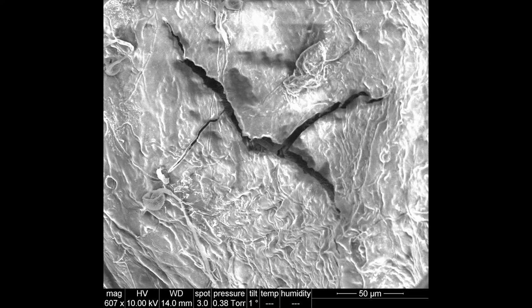If you look at the lower left hand of your screen, you can see the magnification, and you can also see the length scale down there in the corner. Unfortunately, we can't read any of that. It's just the quality is very blocky right now. Okay. Well, I will just talk through what we're looking at in terms of length scale. Right now, this is a blown up version of the poop. It's about one, maybe 2 or 3 millimeters in diameter right now.